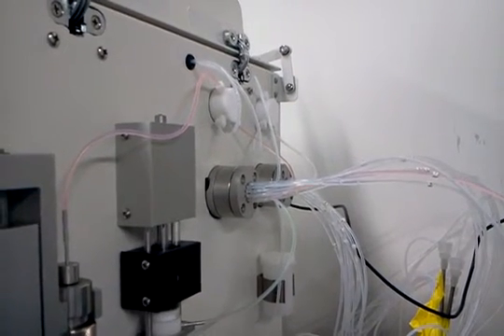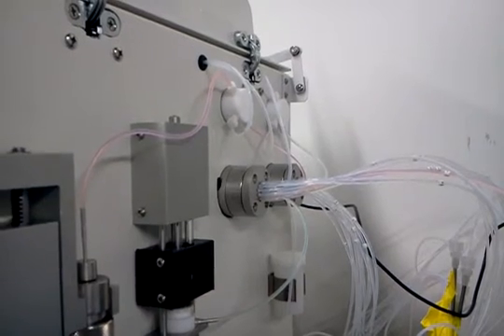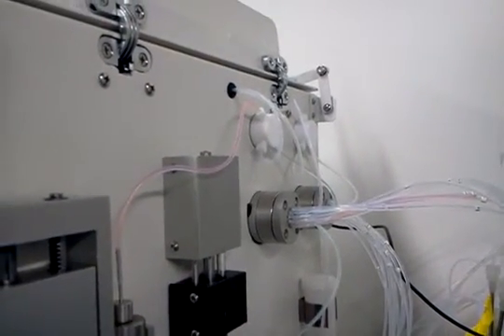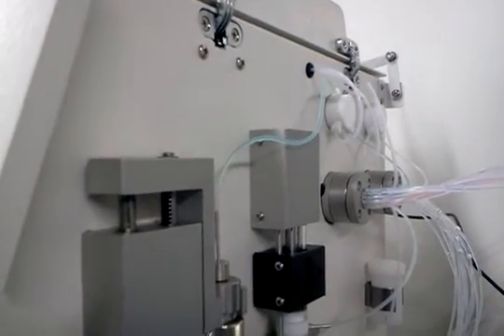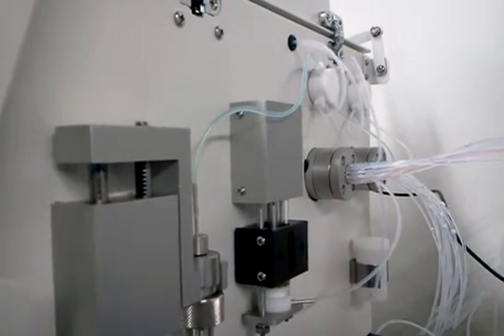We pull the sample just into the 12-port valve, and now we are switching and pushing the one mil sample onto the head of the column. Right there you can see the small bubble separation that separated the sample from the methanol itself.